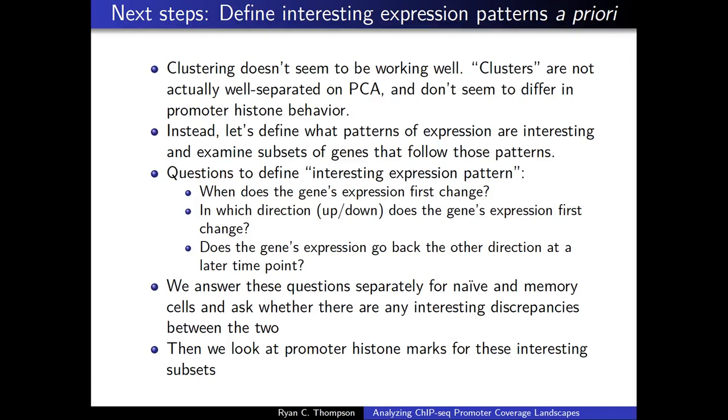What if you took just the most extreme examples instead of the entire cluster? To the edges of the... So you want me to basically... How would I do that? I'm doing k-means clustering, so that's not trivial. I guess I could switch to some other... I could select for the highest PCA scores, or the furthest apart in principal component space.